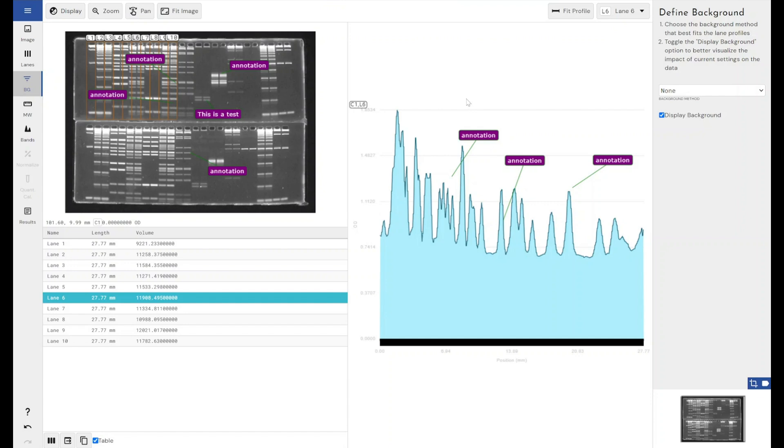Turn them off and on and then export that as part of your report and have all that information. Again, in 10 years time, if you go back to a report and you're wondering what the hell any of the bands were, what any of the antibodies used were, visualization, what the sample was, annotations are a really good way of maintaining that information with your experiment.